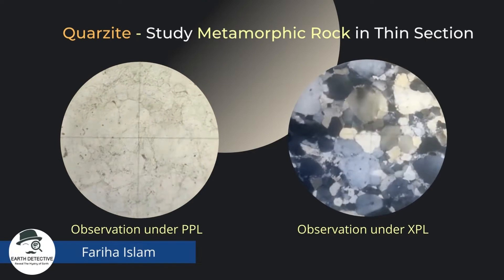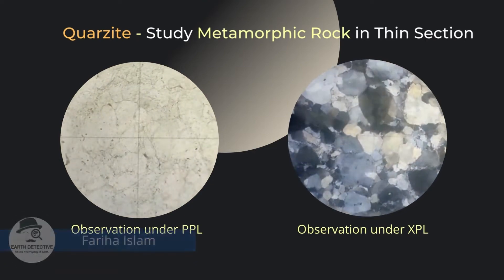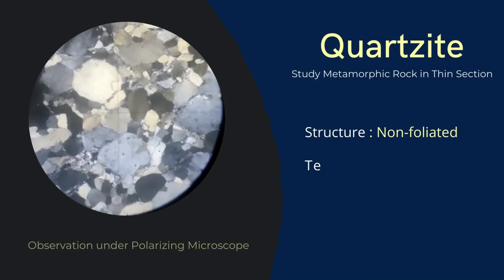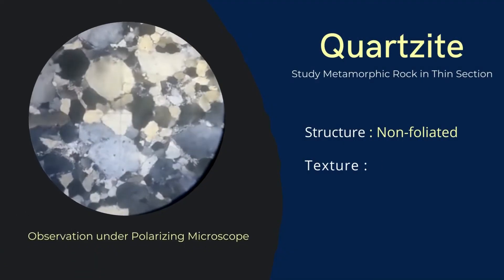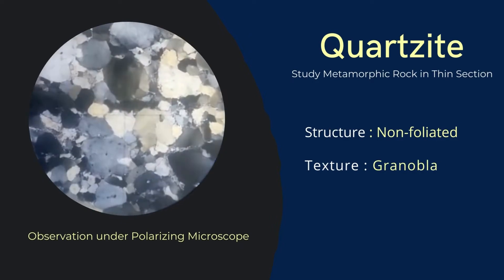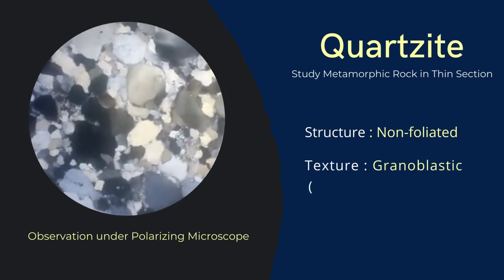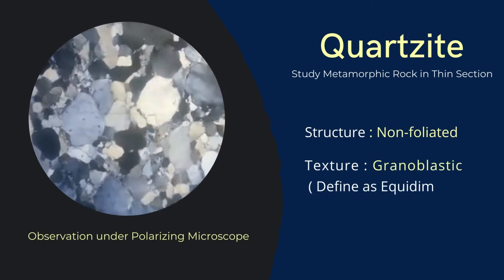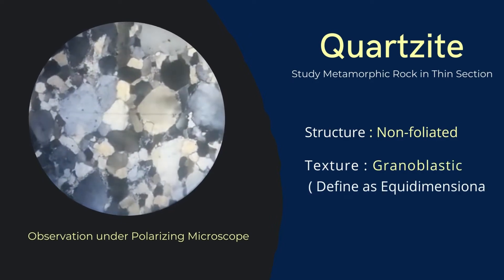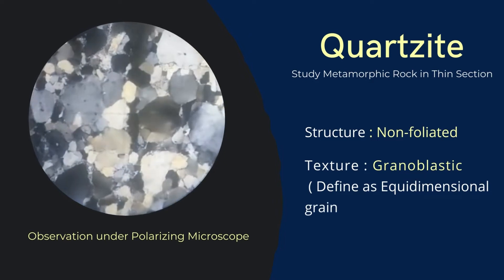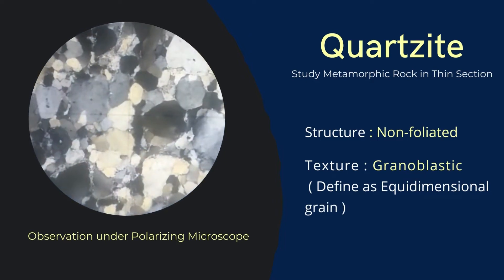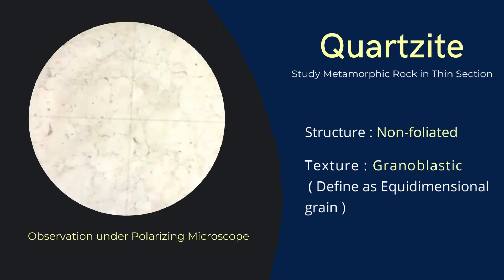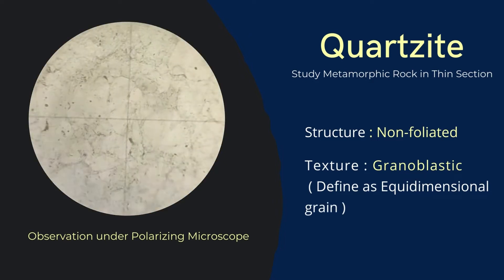Hello everyone, today we are going to study a metamorphic rock under the microscope. The structure of the supplied rock is non-foliated, and the texture of the grains is granoblastic, which is defined as equidimensional grains.